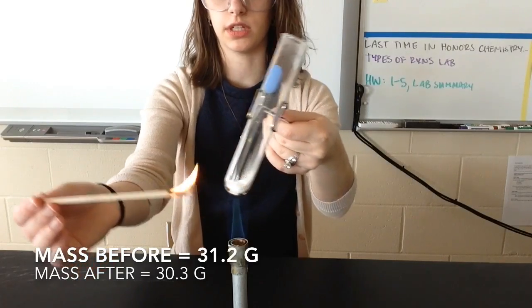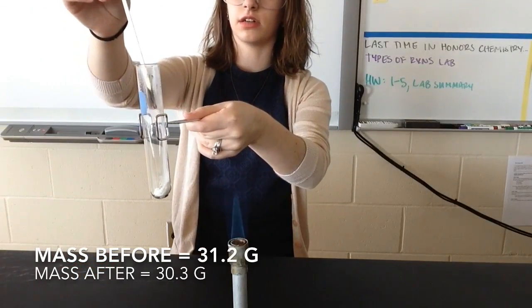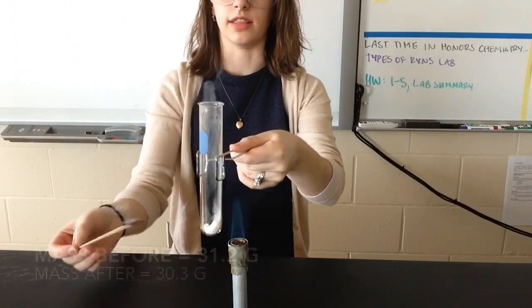So light my wood splint on fire. And there we go.